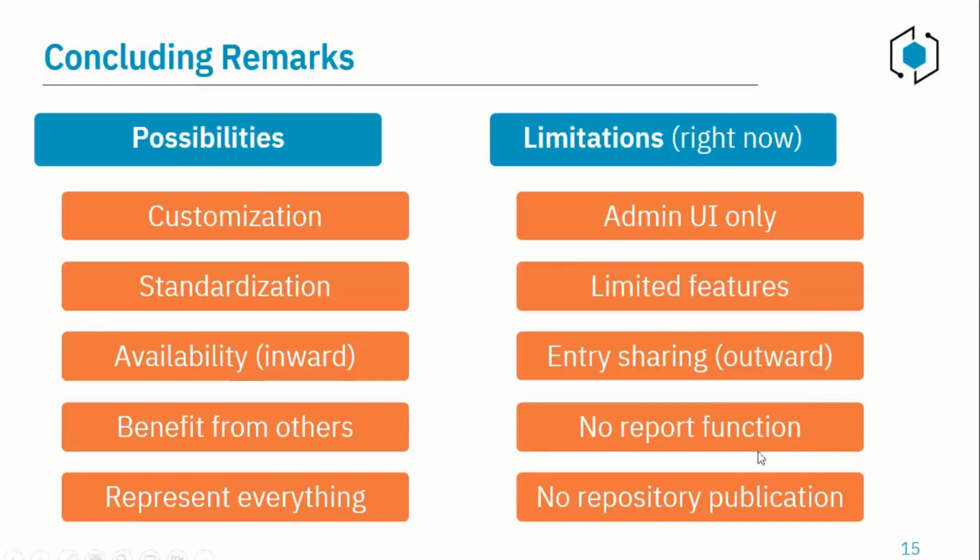And additionally, right now, there's no preset report function for these element types. So when you're using the ELN, you might know that you can simply give out a report of reactions and samples and so on by just clicking a button, and afterwards you might end up with perfectly fine supporting information for a paper, but this doesn't work for generic elements right now.